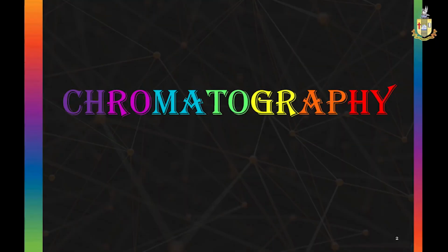Hello students, in this class we are going to learn about chromatography and one of its types, that is ion exchange chromatography, in brief. Before that we will see what is chromatography. Chromatography is a biochemical technique in which the components of a mixture are separated based on their different migration. In this method, various biomolecules such as fatty acids, amino acids, carbohydrates, etc. are separated and identified.